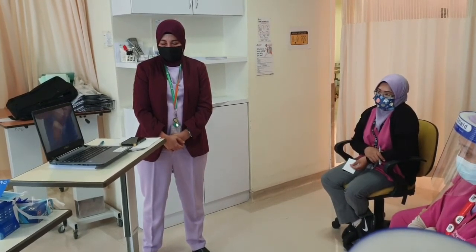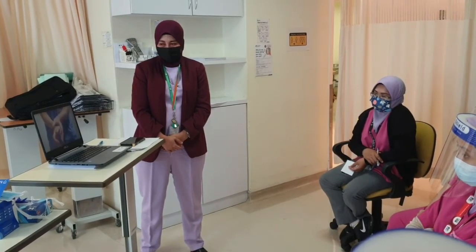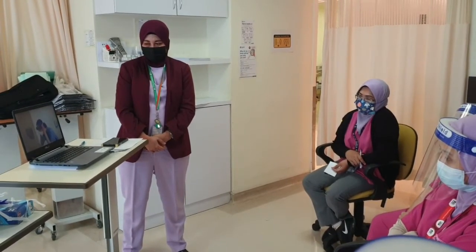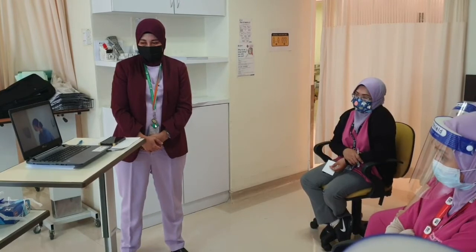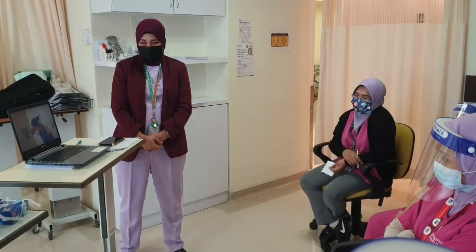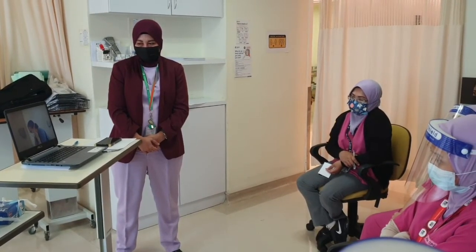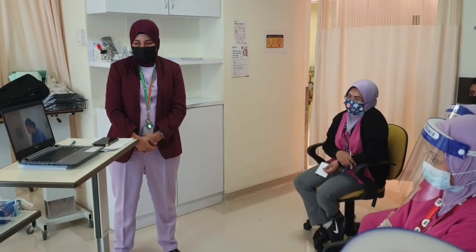Perform hand hygiene for 15 to 20 seconds. Remove the face shield by leaning forward, pulling the strap forward and away from you. Place it into the garbage. Remove the N95 mask without touching the exterior part of the mask. Again, pull it forward and away from you, starting with the bottom strap and then the top. Place it into the garbage.